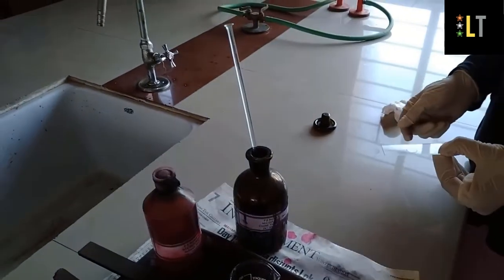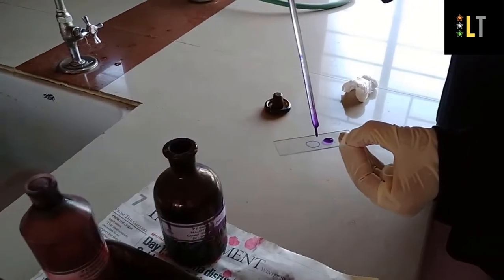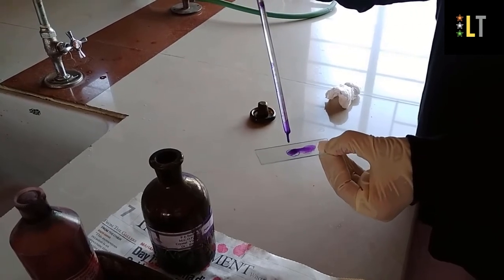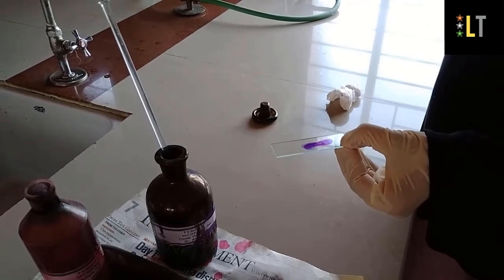We will be adding the primary stain, which is crystal violet. We will be adding 2 to 3 drops of this crystal violet in the marked area, and allow it to stain for say 1 minute.